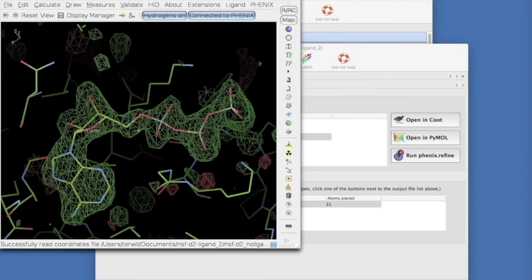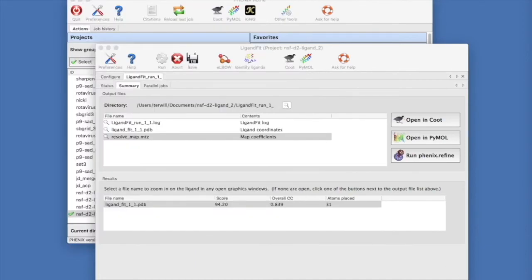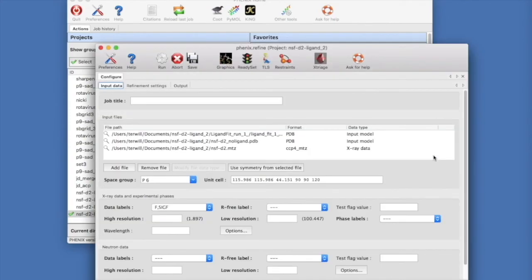Usually, the next step after ligand fitting will be to run refinement with the entire molecule and ligand. You can just click on the Run Phoenix Refine button, and the refinement run will be set up for you.